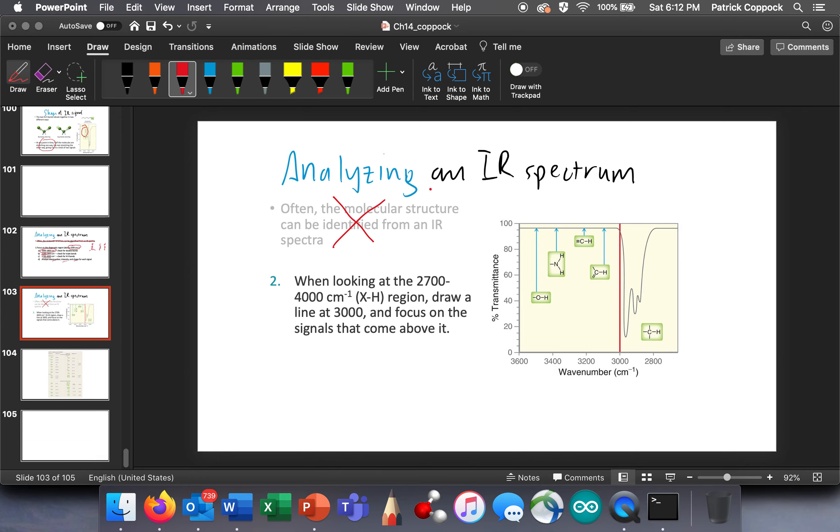Again, I already said we're not going to identify it with the spectra, we're going to use the information. Now, the second thing we do is when we look at this 2700 to 4000 range, we draw a line at 3000 and we focus on the signals that come above it. Because these below it are generally the CHs, and virtually everything we're dealing with has got some sp3 hybridized carbons with hydrogen bonded to it, and that's what this is right here. But above that, we're going to get some interesting stuff.